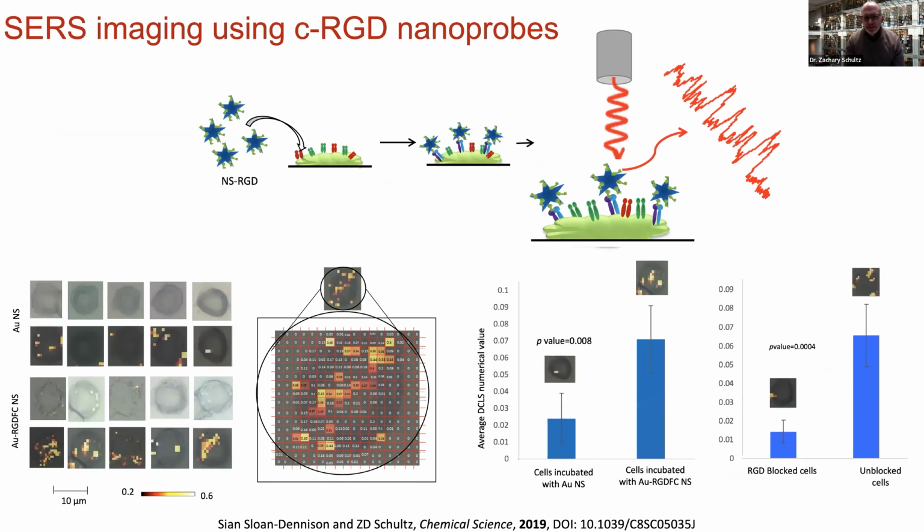We've been able even to develop this into a SERS-specific diagnostic or assay for specificity, right? So we can take the spectrum that we know corresponds to the receptor of interest, and then we can do a Pearson's correlation against the spectrum observed at every point in the cell. So this map over here is kind of fun. The little numbers inside the red boxes are the Pearson's correlation coefficient to the known spectrum of a peptide-receptor interaction. And so we can score all the places that we detect Raman signal to determine the average correlation across a field of view or a cell, and then use that to say what the specificity of that peptide-functionalized nanoparticle is to that specific receptor.